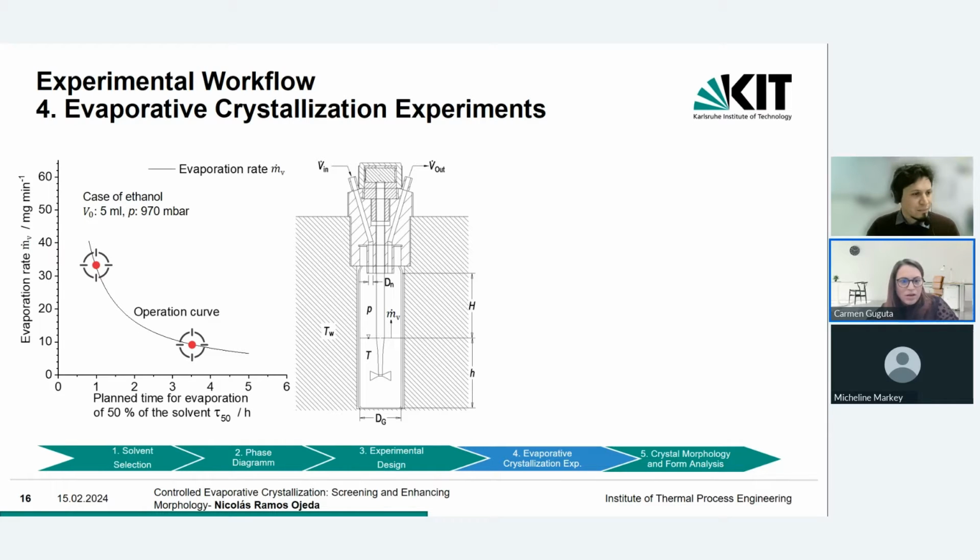Thank you. Let me take it systematically from the very beginning, so we are not confused. One of the first questions: are there options to do basic slow evaporation with the presented setup in the Crystal16? I will take that one. No, indeed. The Crystal16 is our only instrument that doesn't have the possibility of using evaporation.